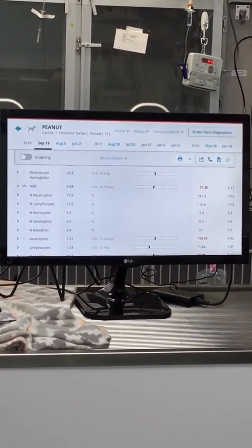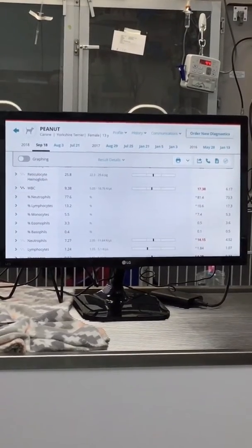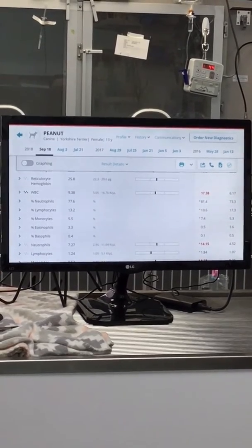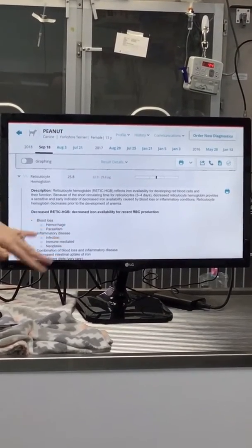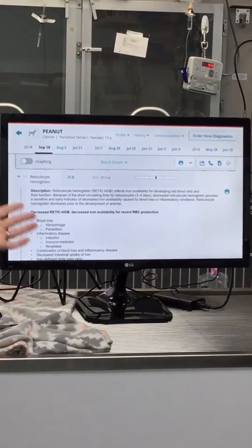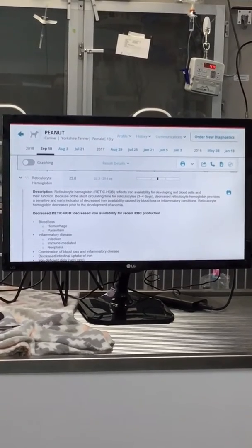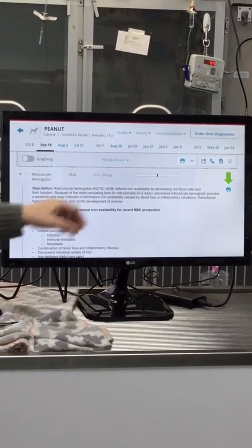There may be times when there's a test that you don't know what it is. Have y'all noticed that now reticulocyte hemoglobin is a parameter on your CBC? So if you didn't know what that is, if you hit this little chevron there, it's going to tell you what it is. It's going to tell you what would make it abnormal, regardless if it's high or low, and recommendations for additional testing. Now, that being said, this is not IDEXX made. I mean, it is. What we've done is we've gone through textbooks, publications, peer-reviewed material, everything, and combined it for you. And then what's nice is it doesn't show you on here, I wish it did, you can also print it.